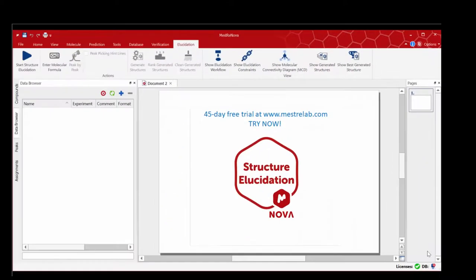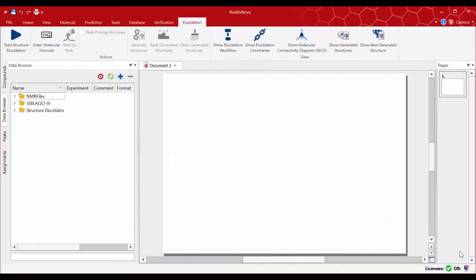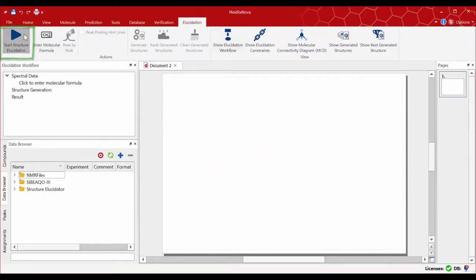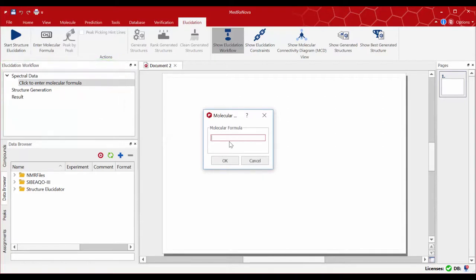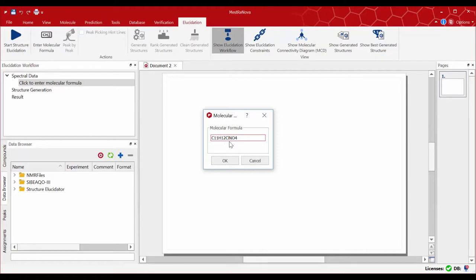The first step will be to click on the 'Start Structure Elucidation' button to display the workflow on the left-hand side panel. You must then enter the molecular formula for the compound to be elucidated, either by following the instructions in the workflow panel or by clicking the different buttons on the menu bar. Once you enter the molecular formula, the MCD — or molecular connectivities diagram — will be automatically displayed.